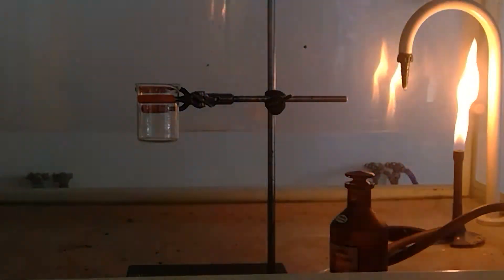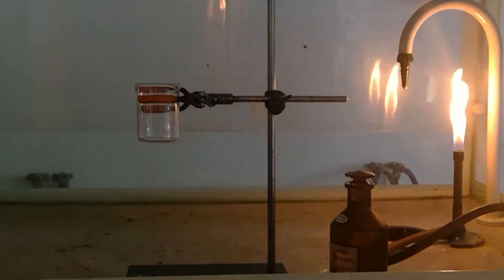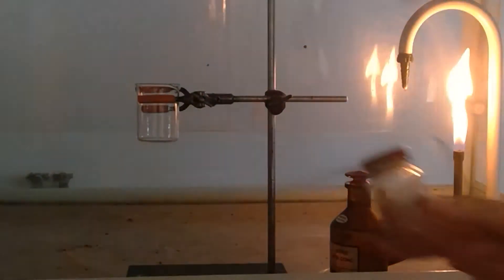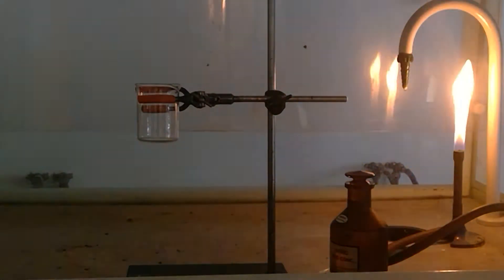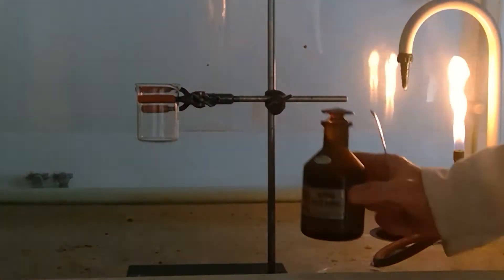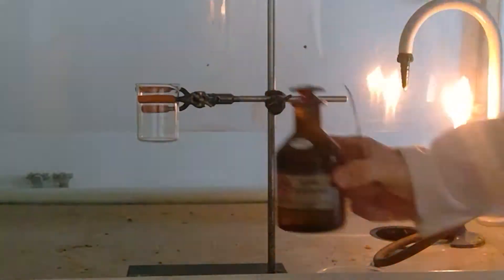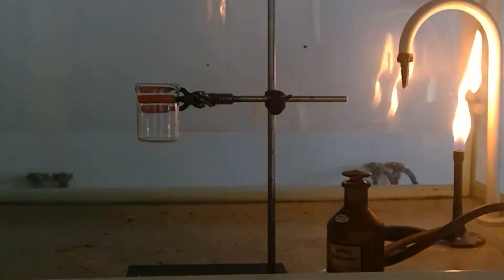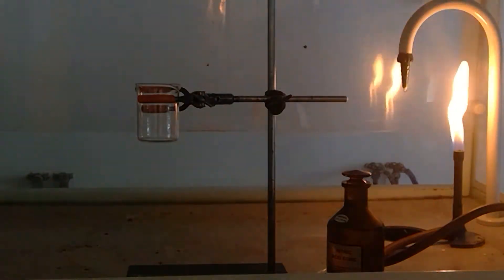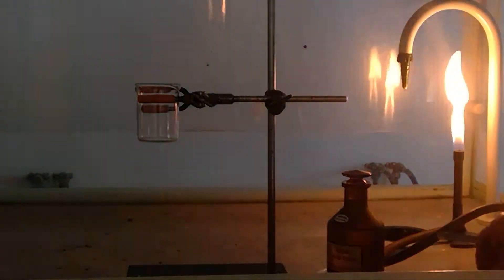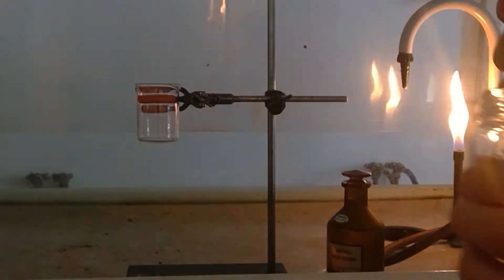This is the production of the pollutant gas nitrogen dioxide. We're going to use a mixture of copper solid with concentrated nitric acid. The reaction is instantaneous and a brown gas is produced which is the nitrogen dioxide.